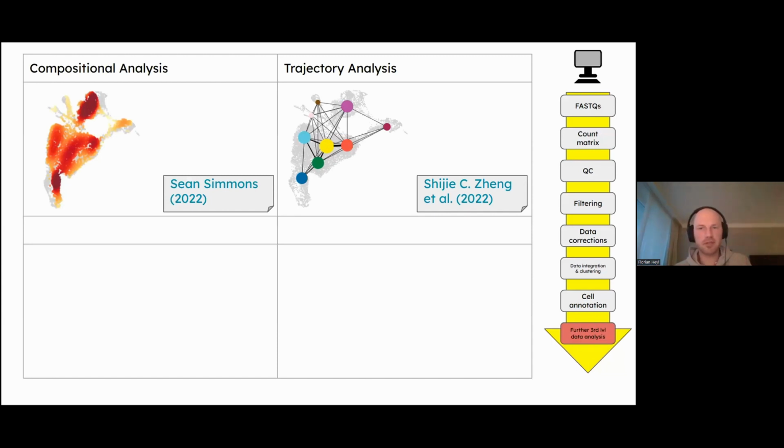Which you sometimes see for cancer, and then your cell will proliferate and so on. So you try to find a target in order to stop the cell from going into the steady state. And this is what you can investigate with trajectory analysis.